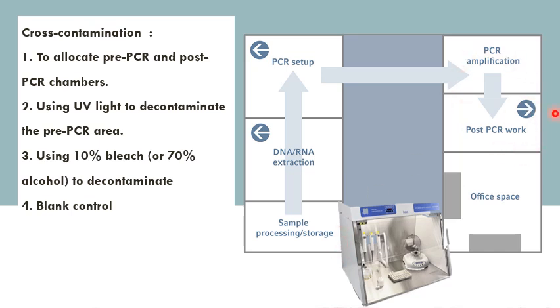Why don't you carry back your tools and use the same tools in the PCR and the pre-PCR? First of all, the pre-PCR is where you process your sample, you store your sample, you extract your DNA. These are all considered pre-PCR.